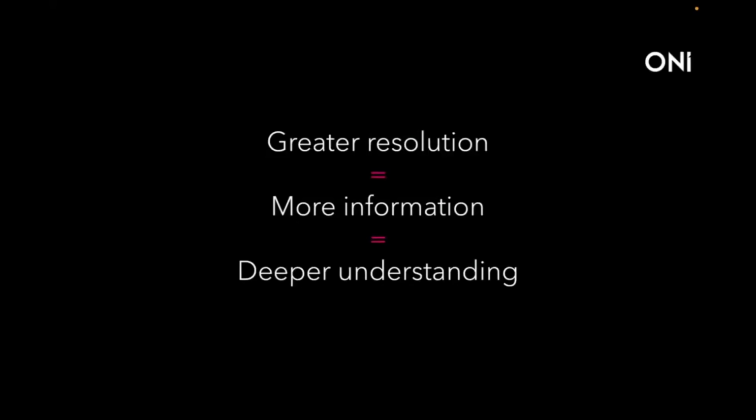So today in this webinar, I'm going to give you some examples of how this has been applied in immunology. It's worth saying at this point that a lot of the data I'm showing today was not collected by ONI or on ONI instruments. I will acknowledge the authors throughout. Most of this is published information from the literature, and it uses a variety of different super resolution techniques. I'm not going to go into the details of each one because I want to get across the potential and the importance of super resolution as a concept. But obviously all of the references will be given, so please feel free to go away and read up the papers if you're interested.